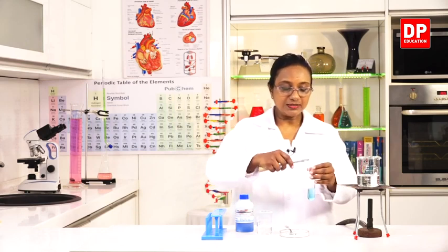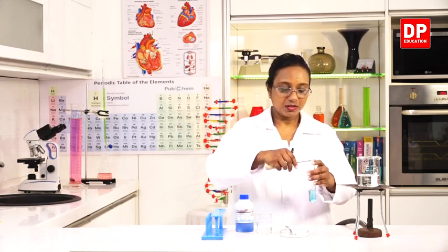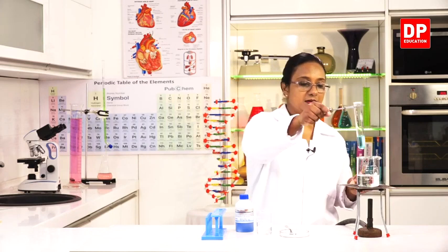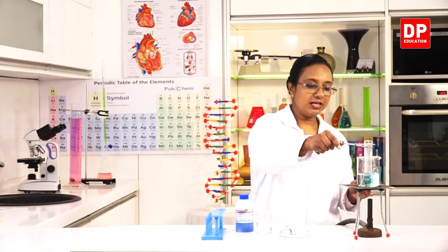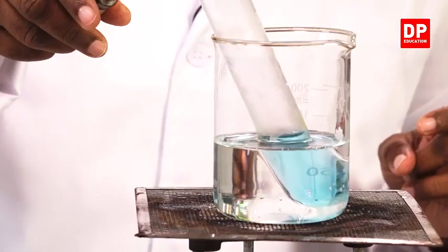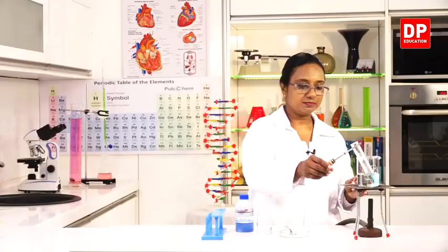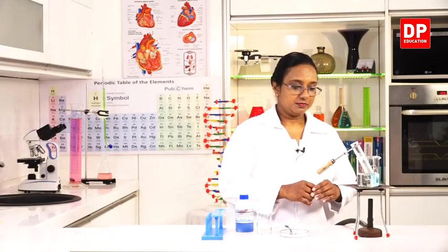To place the boiling tube inside the beaker so that it will become hot gradually. Now you can observe the color change clearly.